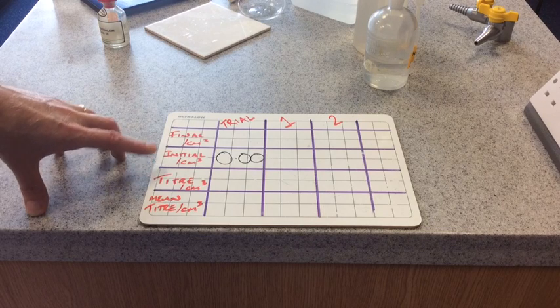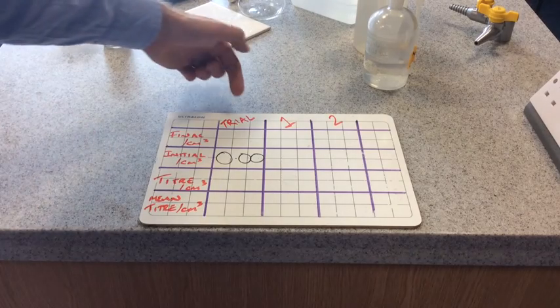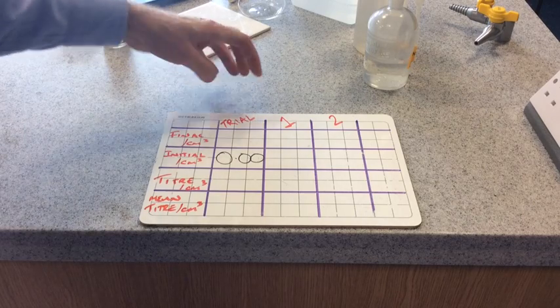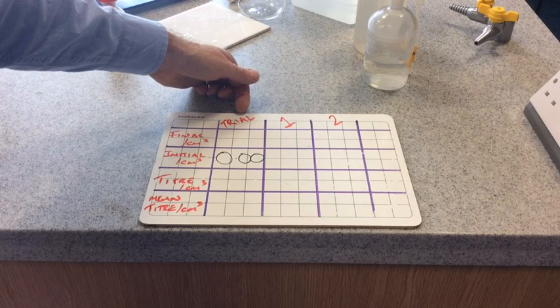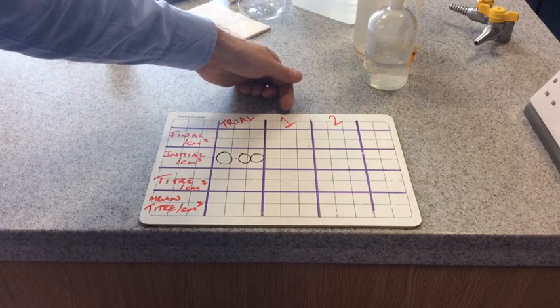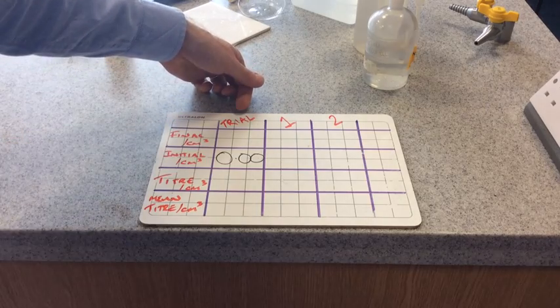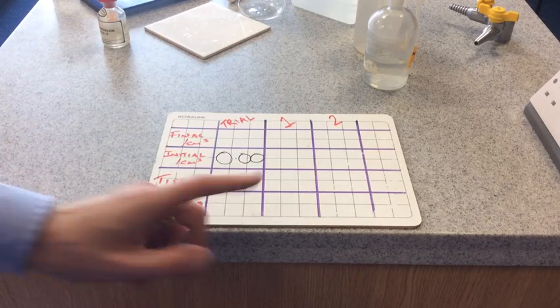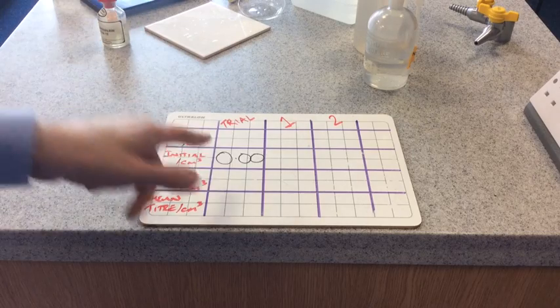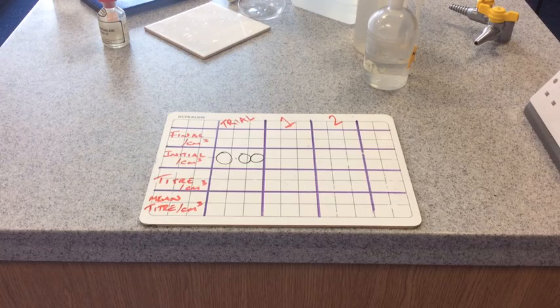The first titration you do is a rough one — a trial titration. Once you get a rough idea of how much solution you need to add from the burette, you go on to an accurate titration. Ideally you carry out two of those in agreement with each other and then you can stop. You shouldn't use your trial results in your calculation of the mean. The initial burette reading for the trial titration is 0.00.